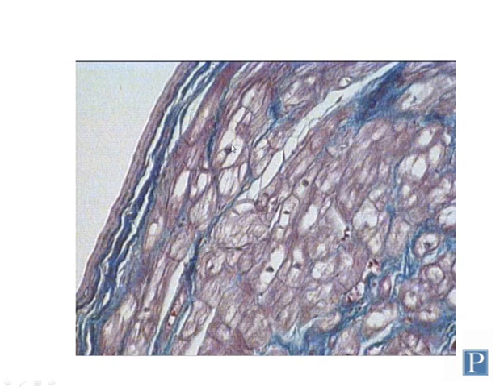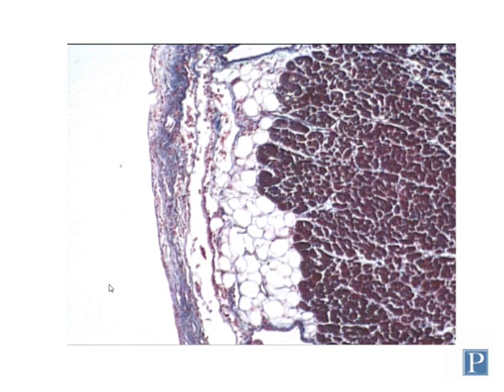Recall that the heart actually has two surfaces. You have the inner surface lining the chambers of the heart, as you can see here. That's where you have the endocardium. The other layer is called the epicardium, and it looks like this. So this is the outside of the heart, which normally would be covered in a pericardial sac.